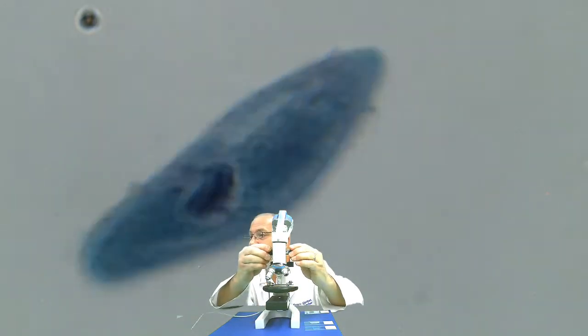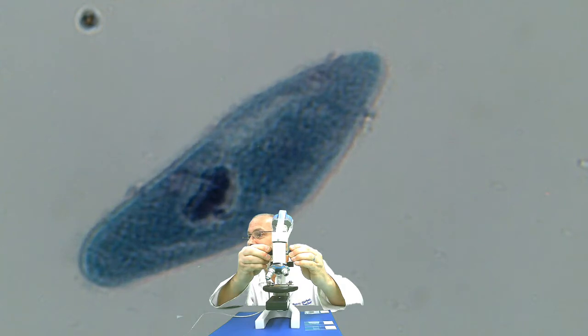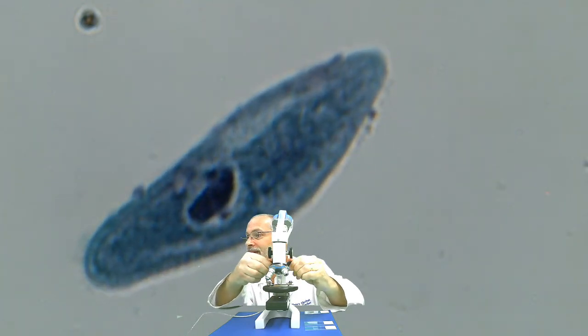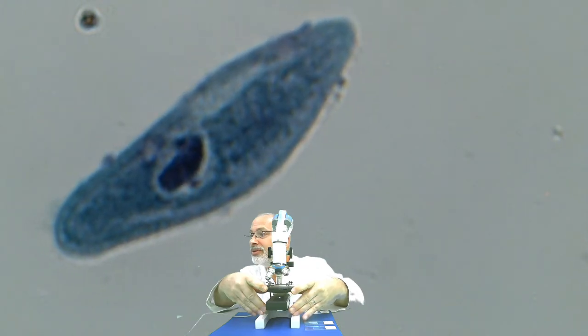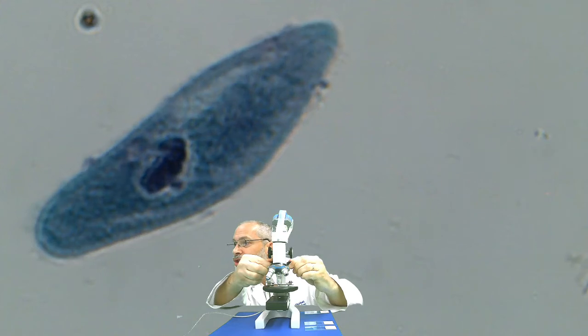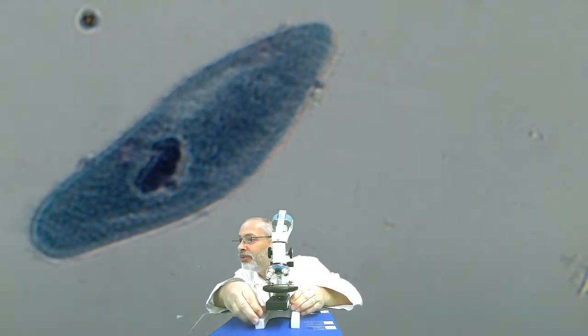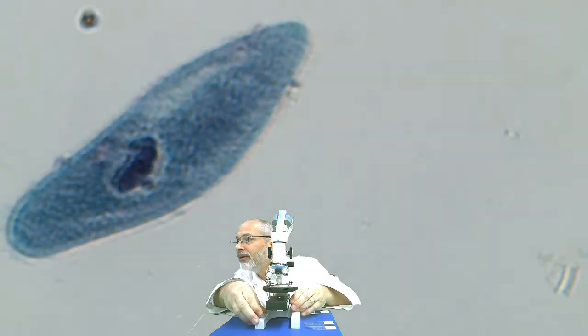Now let me get into focus. Oh yeah, that's a good one. Let me use the fine adjustment here and scoot him around so we can see him. And let me just adjust the lighting a little bit more. Oops, wrong way. Get him a little bit brighter.